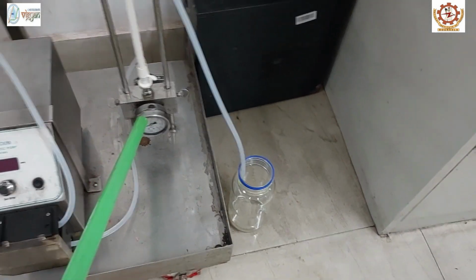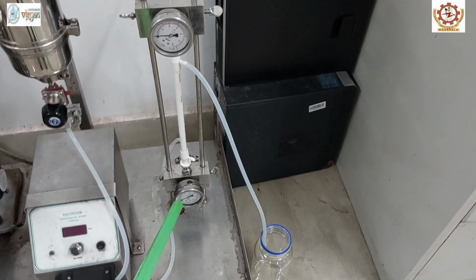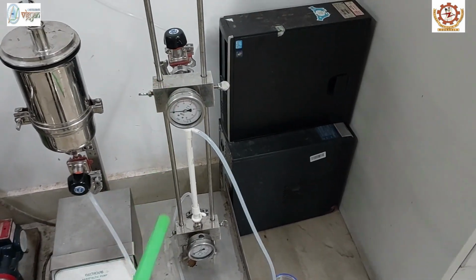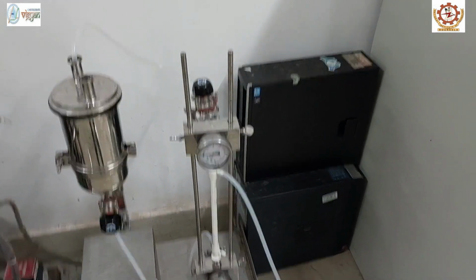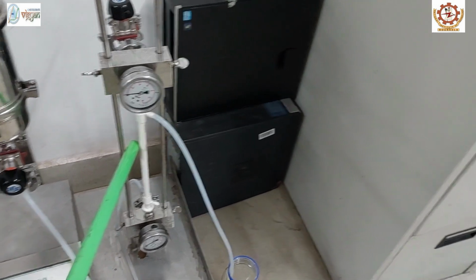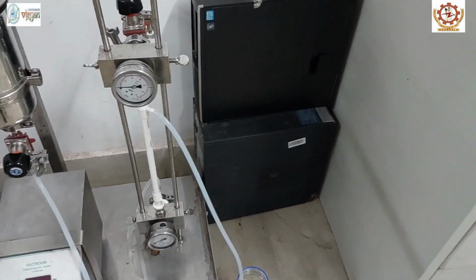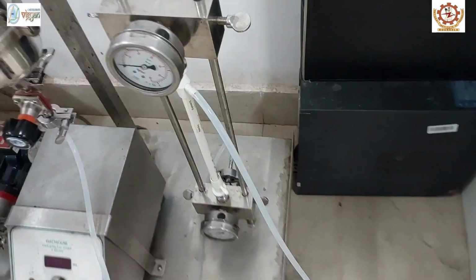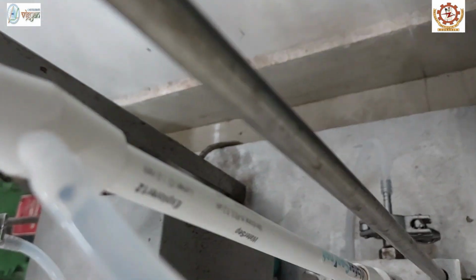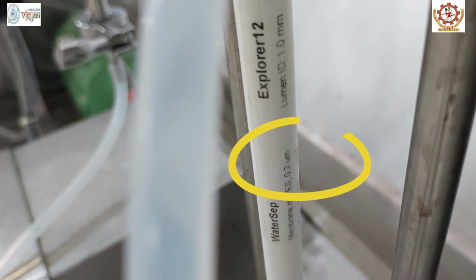Here it has two pressure gauges to calculate the total pressure, the total transmembrane pressure of the process. And it has a membrane holder where we will keep our membrane. This is a microfiltration membrane of size 0.2 micrometer. Its size will be written here. 0.2 micrometer is its size.